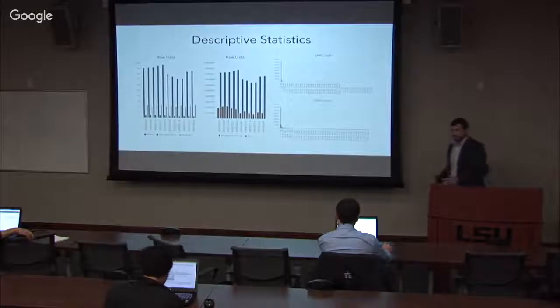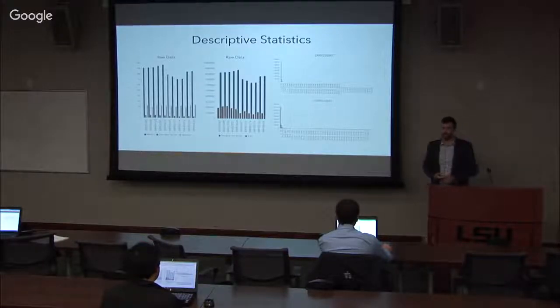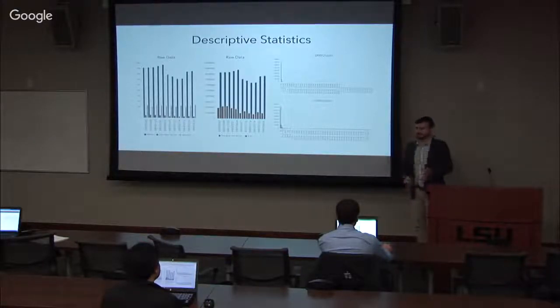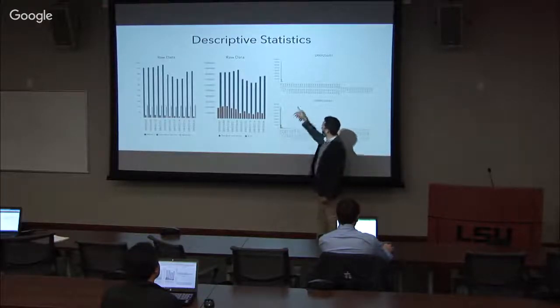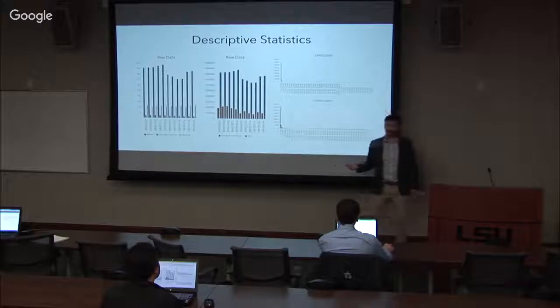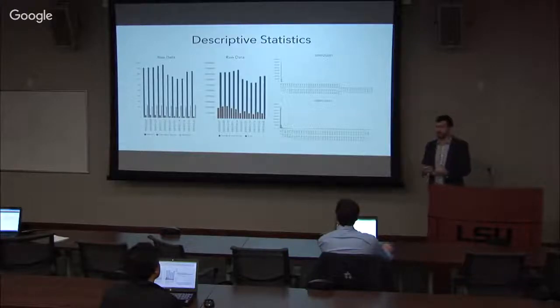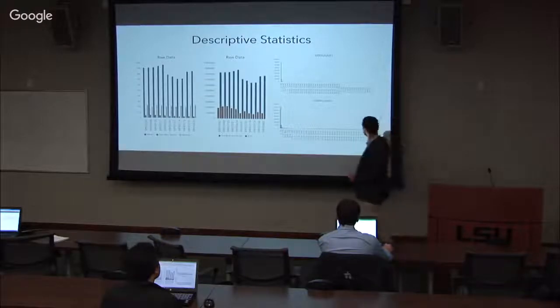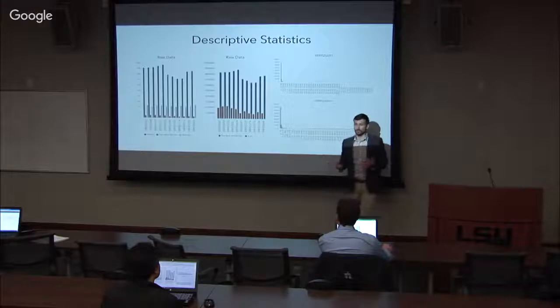So now another way to look at the data is to prepare a histogram. And this is what you're seeing on this side. And why is that important? So a histogram says, let's take a bin from 0 to 5, for example, right over here, or 0 to 74 on the raw scale. And let's take everything, separate them into these bins, and just count how many of the genes do I have that have this expression. And so what you can see is that you have a lot of outliers, and then most of your data in the very low end.